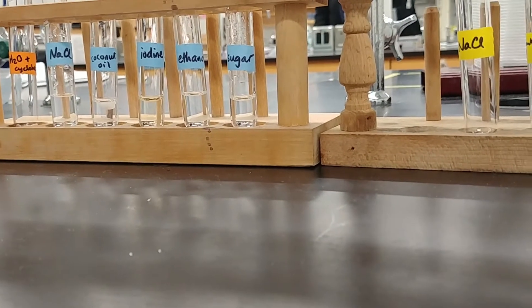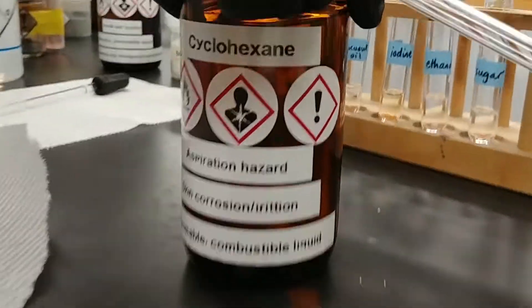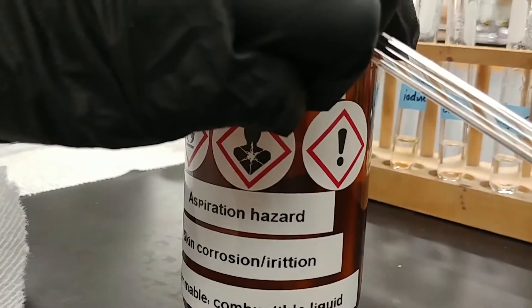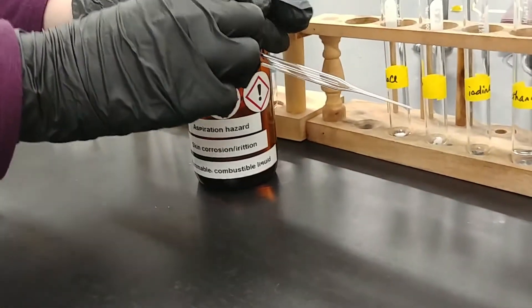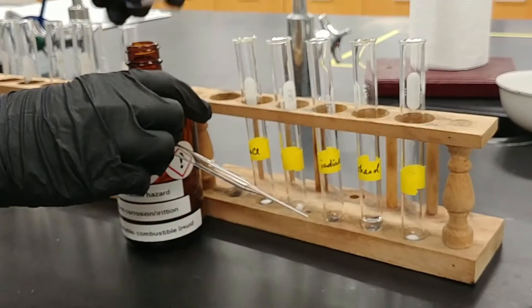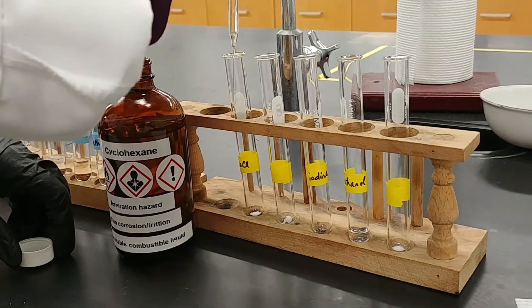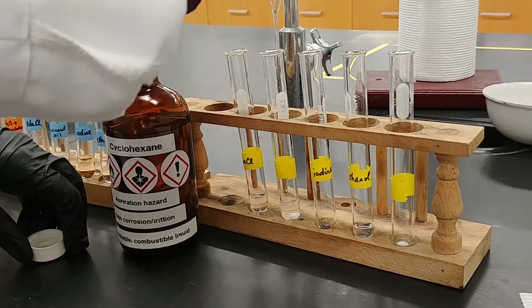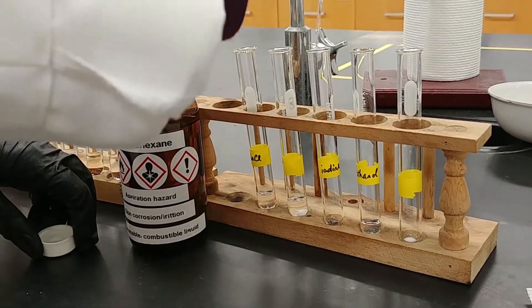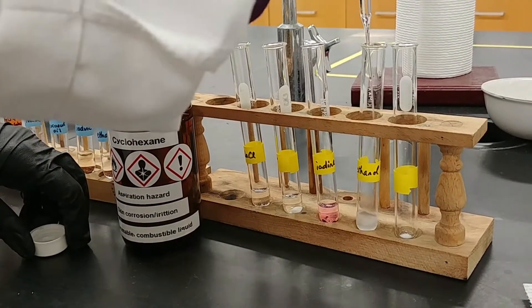So that is the water solvent. Now we're going to compare this with cyclohexane. Now cyclohexane is a very volatile solvent. That's why we have the parafilm around the cap. Generally, you want to work with this stuff with good ventilation. So I'm going to add again about one milliliter to each of these test tubes.